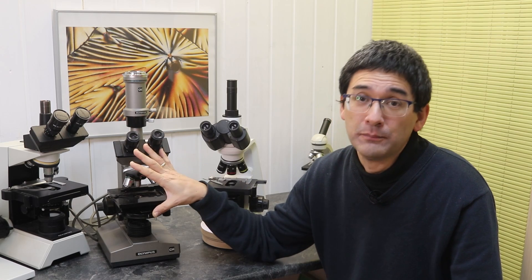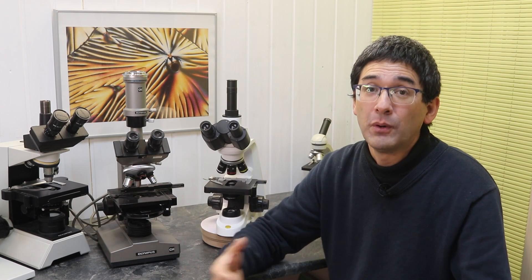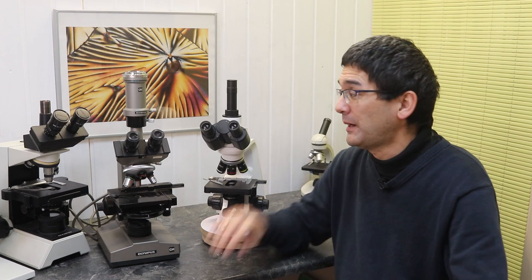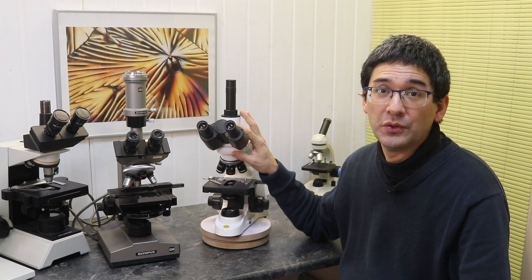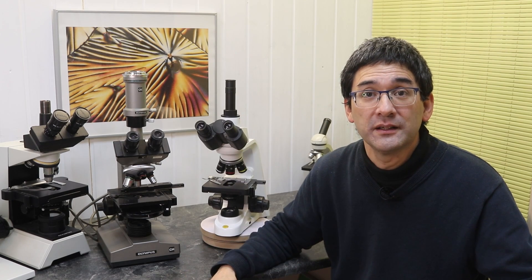If your intention is to resell the microscope later on, then probably it's better to go for a branded model because the market for those branded models is simply higher. New models they don't really have a lot of resale value and I have not seen a lot of the models that are being resold. If you buy this for 500 or 600 euros, for how much are you going to resell it?